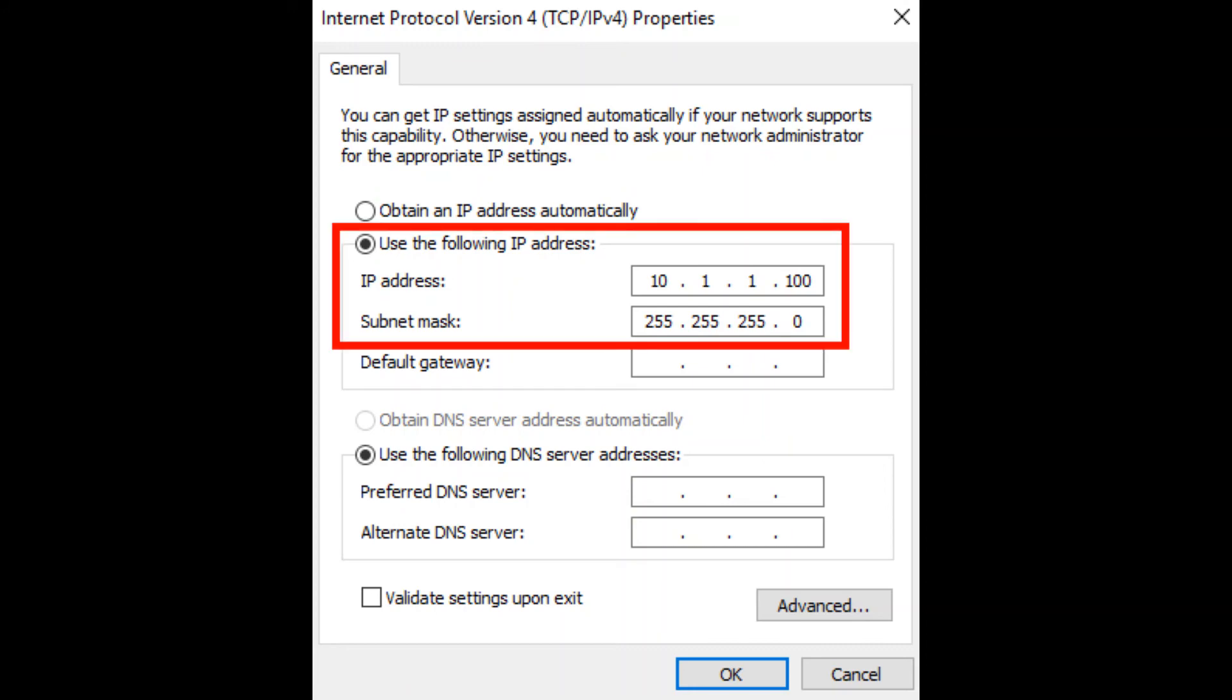The IP address should be different than the MicroGC Fusion IP address. In this example, we are setting the adapter to 10.1.1.100. Consult your IT department if you need additional assistance determining a suitable IP address and subnet mask. Click OK to exit the window.